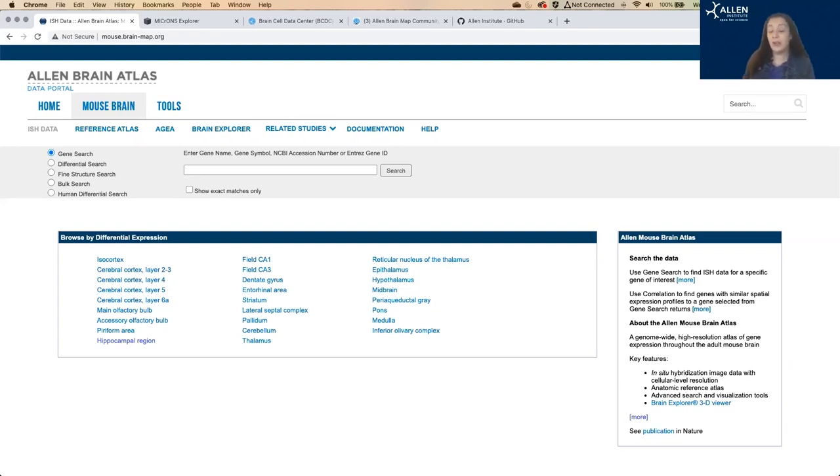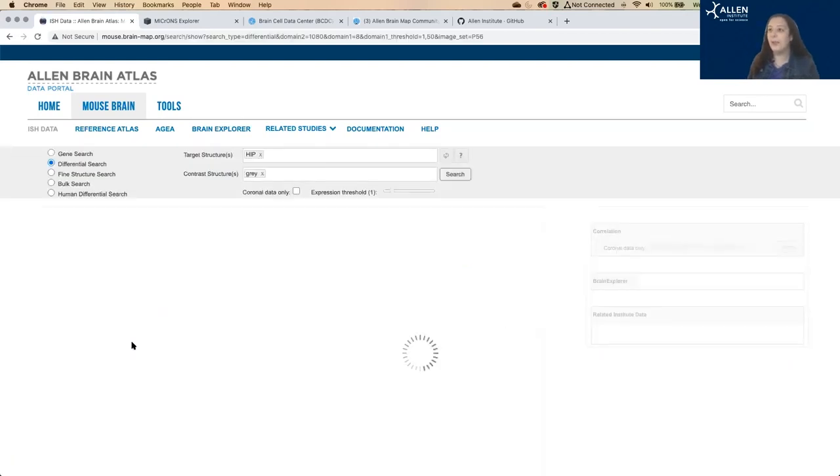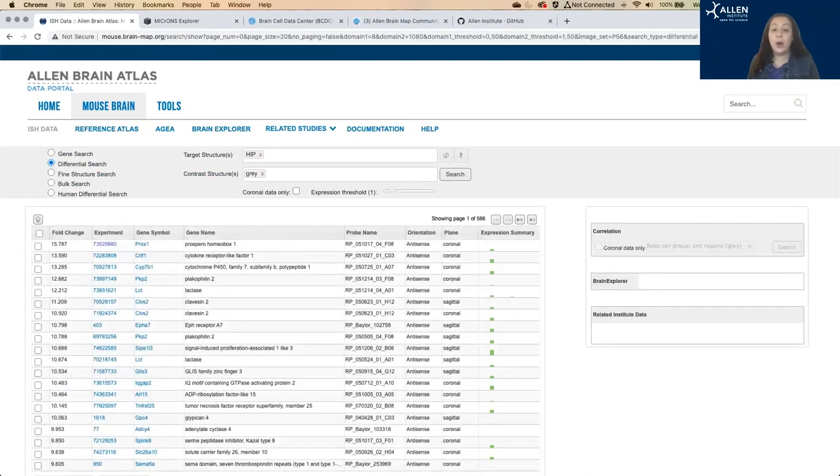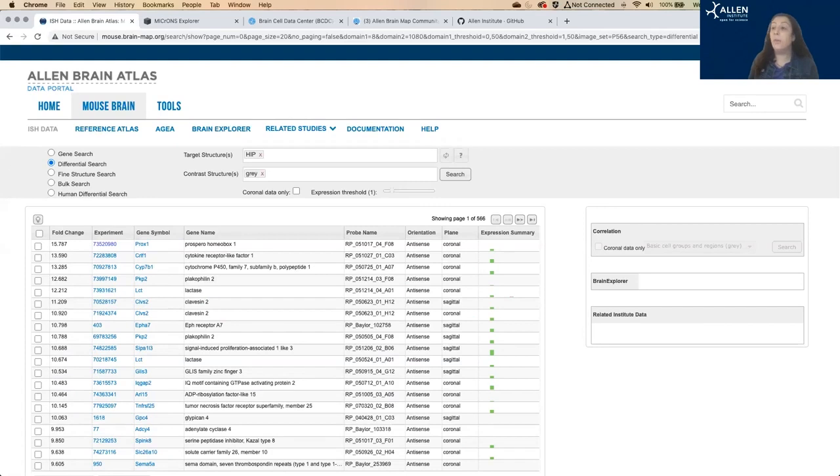So first, I'm going to do differential expression. If you click on any of these selected regions, I'm going to do hippocampus. It's going to show a list of genes that are enriched in your area of interest compared to, by default, the whole brain. That's what gray means here.